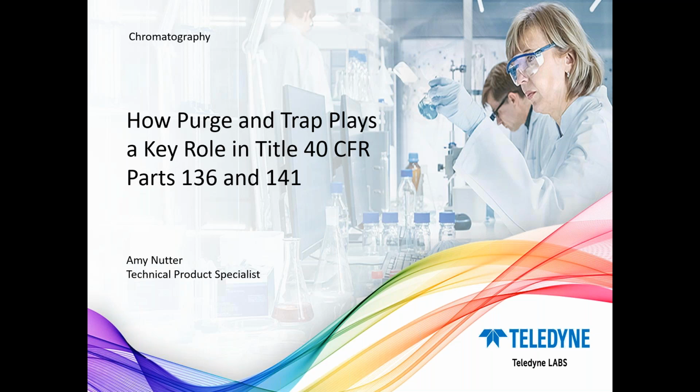All right, thanks, Shelley. Hi, I'm Amy Nutter, Technical Product Specialist for the Purge and Trap product line here at Teledyne Labs. So like Shelley mentioned, today I'll be going over how Purge and Trap plays a key role in Title 40 Code of the Federal Regulations, Parts 136 for wastewater and 141 for drinking water. So thank you for joining me today.